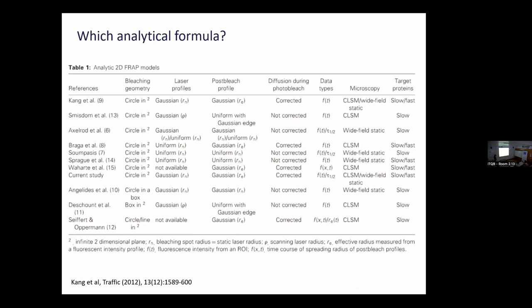at the time, there was a lot of development in expanding the initial FRAP experiments, which were made in solution or in membranes for lateral diffusion in a circular profile. This was done by Daniel Axelrod 40 years ago, to expand it to confocal microscopes and fluorescent proteins in living samples. The lab of Carmo-Fonseca came up with its own contribution to the field.